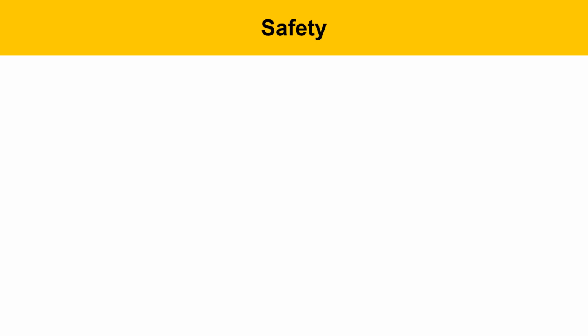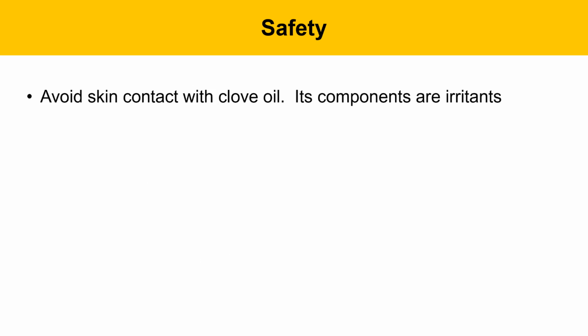Safety for this lab is described on this slide. Avoid skin contact with clove oil. Its components are irritants. This might seem a little counterintuitive because cloves are a spice that people season their food with, but in concentrated form, it is an irritant.